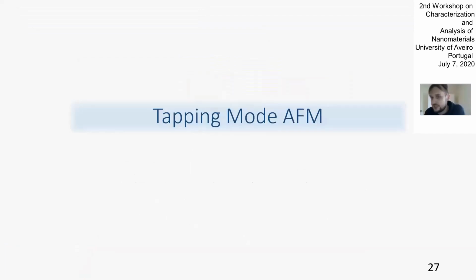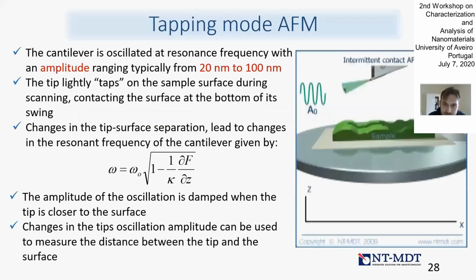And the next point which I'm going to talk about is the tapping mode AFM, which is also very useful for applications, and I think many of you who are working with AFM also have experience working with tapping mode. Tapping mode is a bit different from the contact mode, because you work in a different force regime.